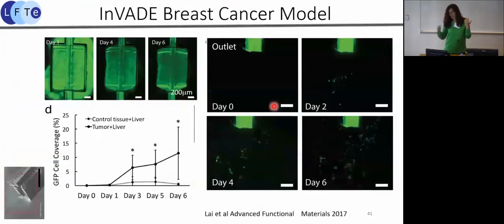And then also now, as we have permeable blood vessel due to the presence of these microholes, with endothelial sprouting, endothelial cells leave the blood vessel and they go into the parenchyma. But when a cancer is metastasizing, the opposite process happens, right? The metastatic cells now invade the blood vessel and they go in. And with this platform, we can study this process of metastasis. We can figure out, with this GFP labeled breast cancer model, how the cells are leaving the breast cancer and how they're accumulating into downstream well.